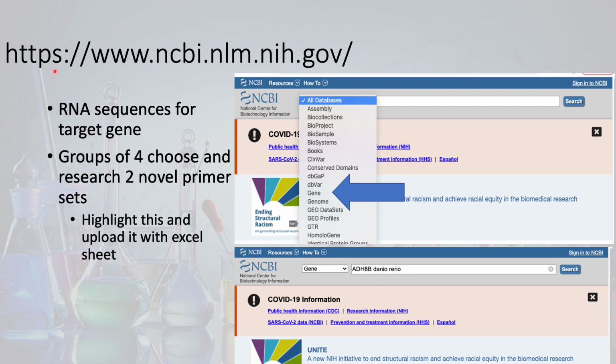After that, if you follow this week's protocol, you will end up on the NCBI database, where there is a slew of biochemical, cellular, and molecular information. In this pull-down tab, you can look up things like sequences and the jobs of specific genes in various species.